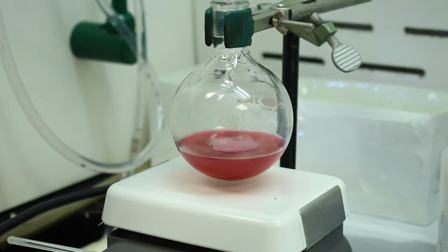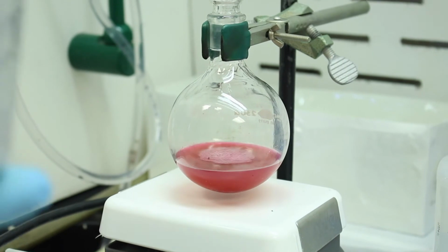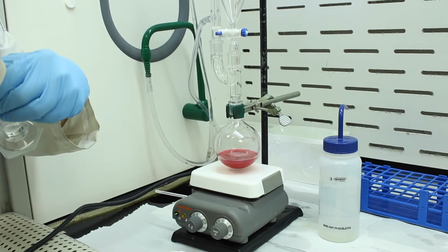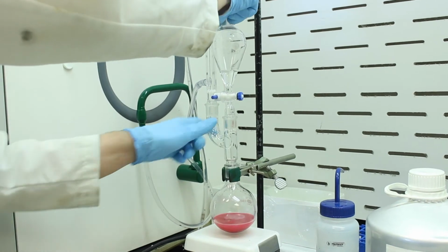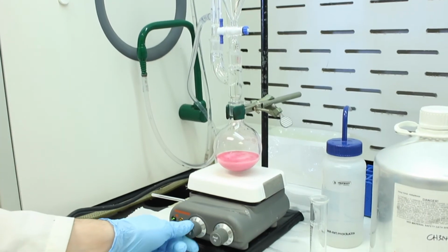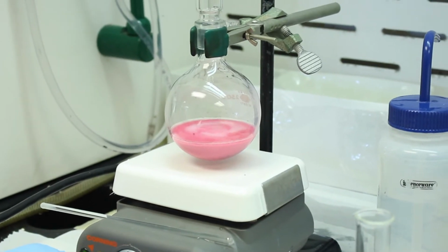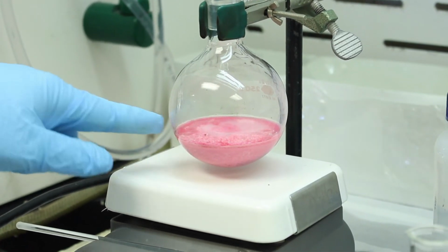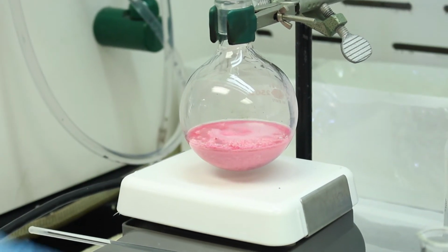Okay, going to add a little bit of ether to the sep funnel to rinse out the residual benzophenone. Nice. So this is typical for this reaction. Eventually there's enough product, the solid is the product, that it precipitates from the mixture. And now we have a nice solid in here.